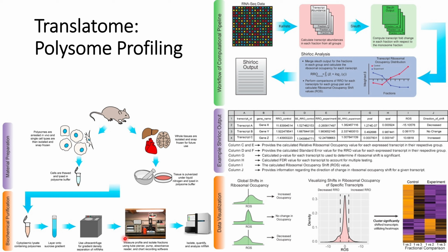And measure using the profile to isolate the free RNA, such as the free ribosomal parts, 20S, 40S, 60S, 80S, and separate them from the samples. Only the polysome will then be isolated and quantified using different strategies, such as RNA-seq data that is shown here.